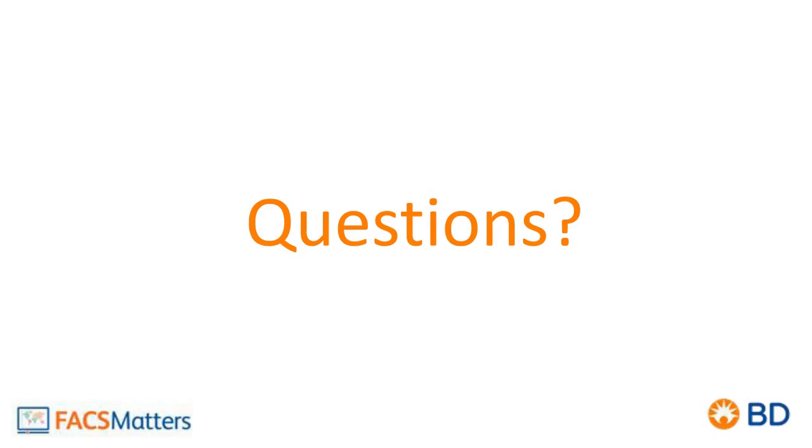Thank you, Alan. Well, you also gave some really great insight to how to evaluate our multicolor panels, and as we learned from you in the past two webinars, there's reagents, there's spillover issues, there are spread issues that we must consider. So evaluating those panels and having the right controls are important. So some of the questions are asking about the right way of processing those samples and generating the right controls. Now, if I'm looking at, let's say, an activation panel, when I'm generating the controls for assessing my panel, should I use an activated sample or something that is a negative or a normal control?